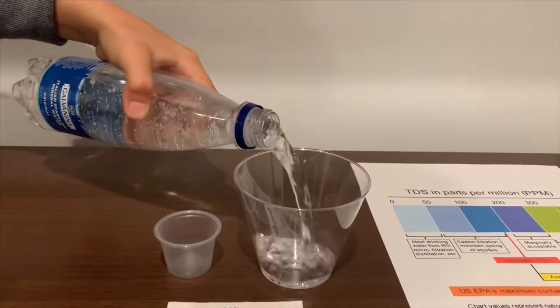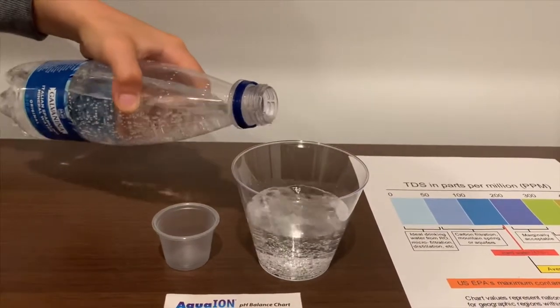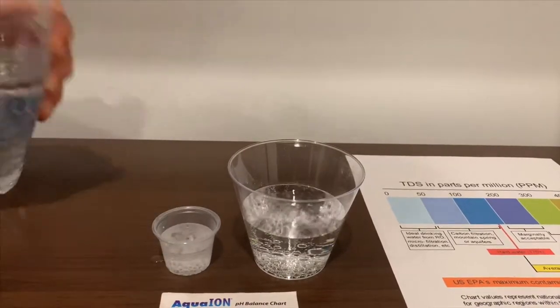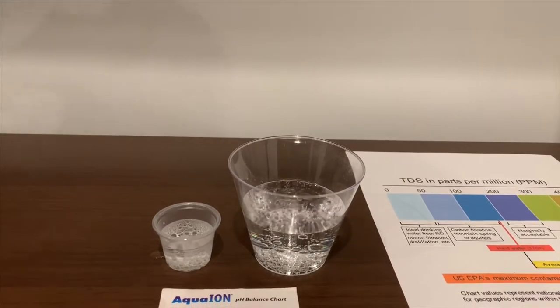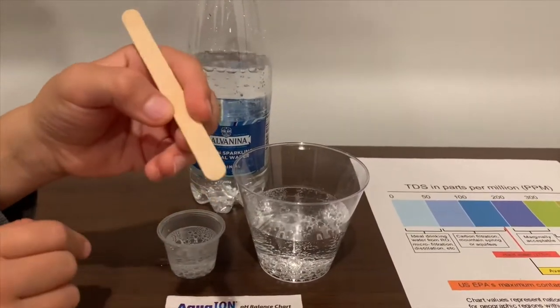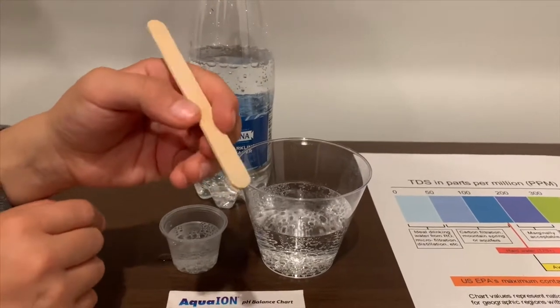Let's pour some water in. First we're going to test the TDS level, but first let's stir a little so we'll get a better result on the TDS.